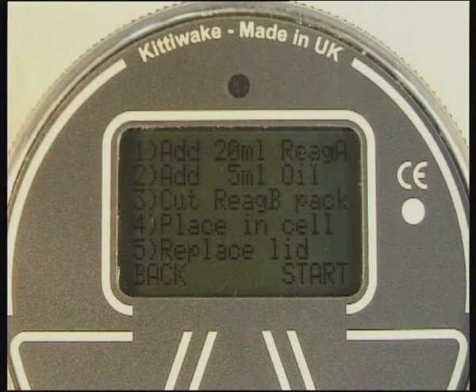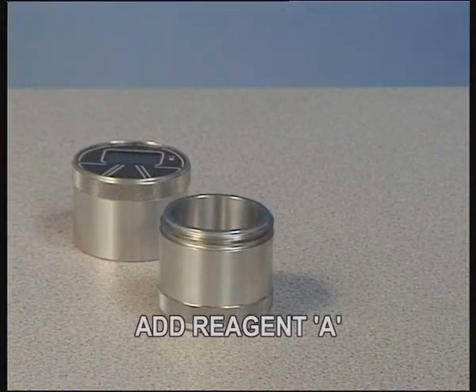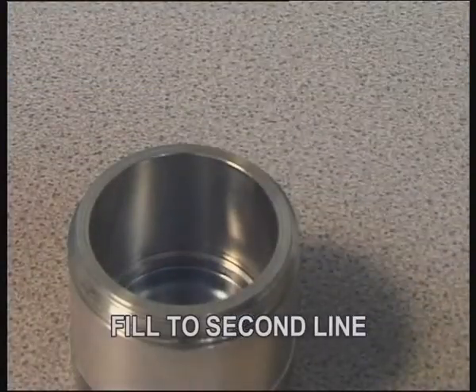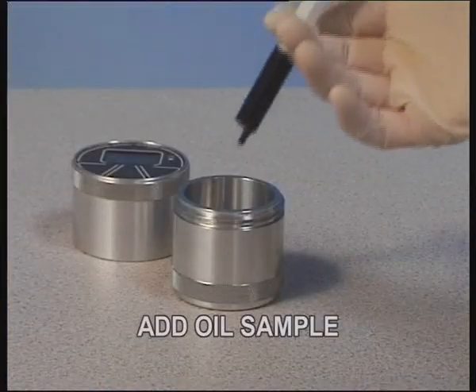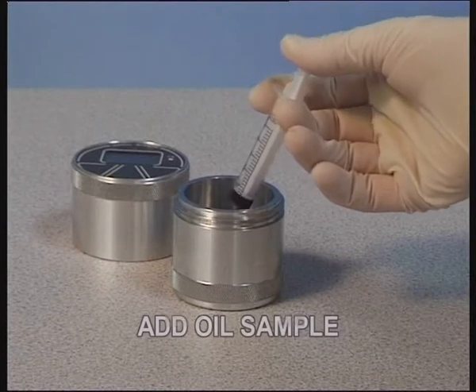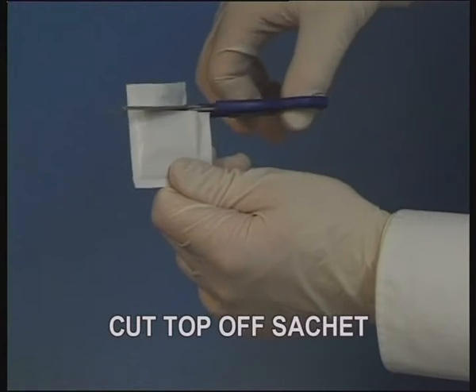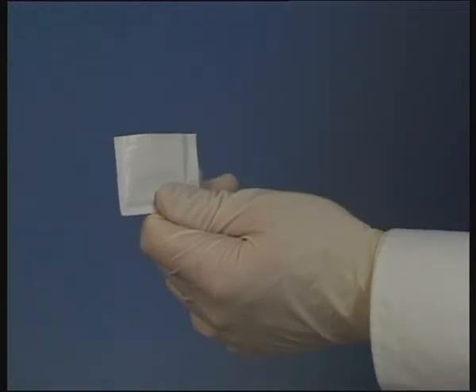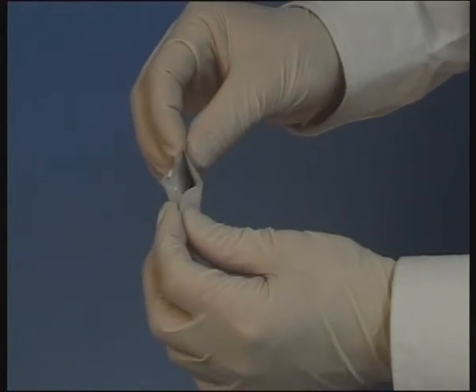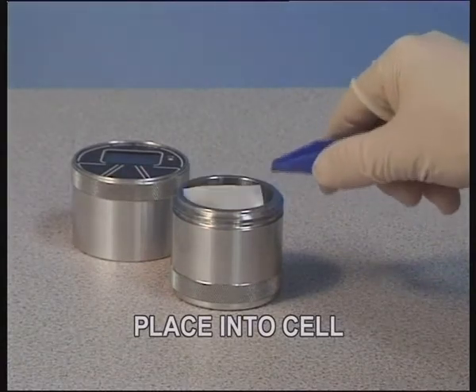Begin the test by following the on-screen instructions. Wearing your gloves, add reagent A up to the second line inside the cell. Add the required amount of oil sample. Carefully cut and open the sachet, then place it in the cell using tweezers.